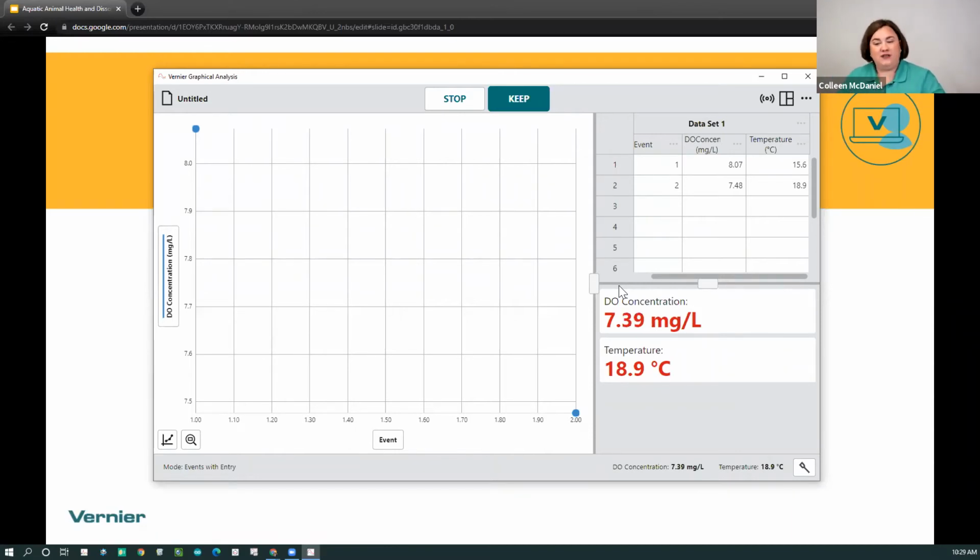So once I'm done doing this, and usually it'll take possibly 5 to 8 trials, depending on what the temperature of the room is, the idea is you want the temperature of the water to reach about room temperature. So that can be anywhere between 22 and, well, 25 and 35 degrees Celsius, basically. 35 is still pretty warm, so it's probably going to be closer to about 25 degrees Celsius of what we're looking at.